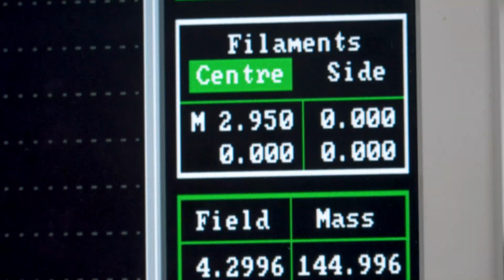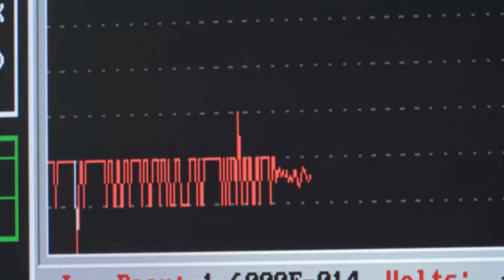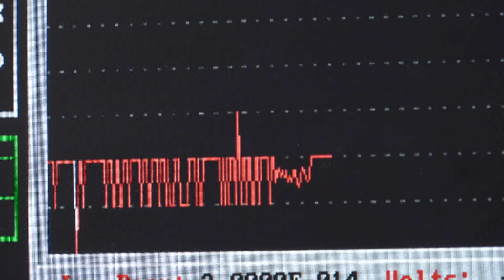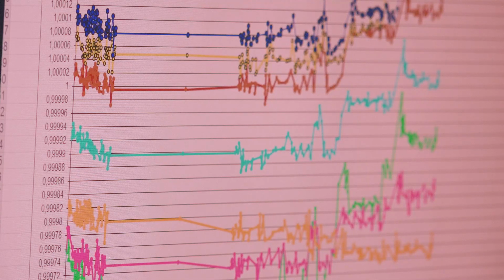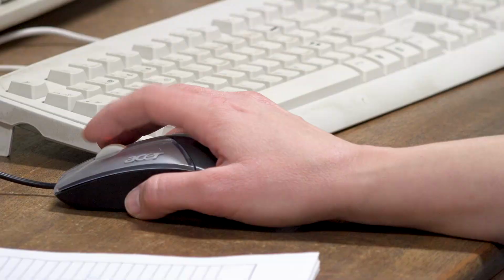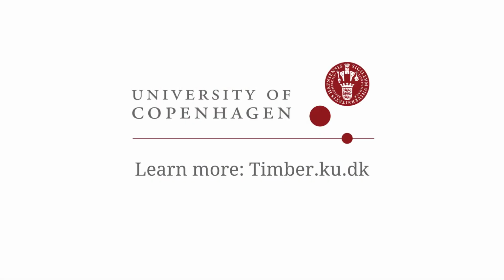So it's like an overview of what areas have what kind of strontium isotopic signature, and does this relate to the archaeological timber samples that I analyze later, which is the last point of these three packages, where I take archaeological waterlogged timber and try, just analogous to the experiments, I try to remove this waterlogging signal, this mostly seawater or river water strontium composition. I try to remove that so I get to the original tree, to the original timber strontium composition. I can see there is potential for this, so I can see a direction to go in, but it's still in progress.